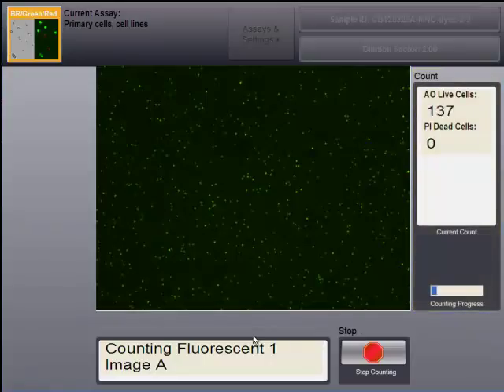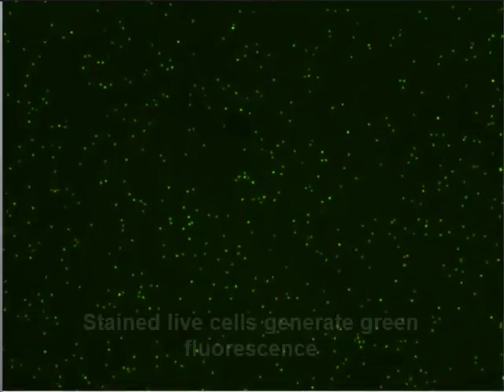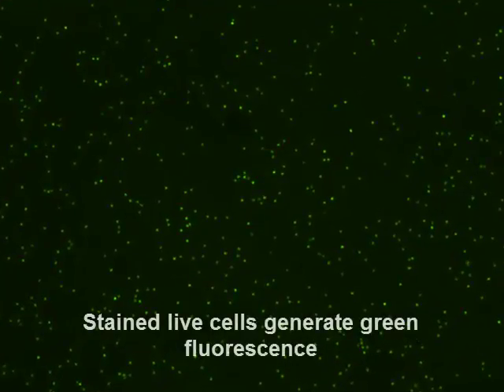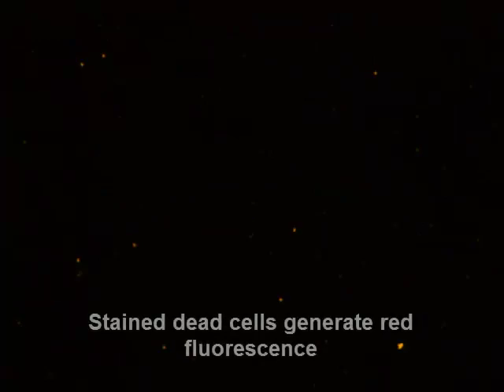Acridine orange is a nuclear staining dye that stains all live nucleated cells, generating green fluorescence that is easily distinguishable from debris and unwanted cell types. Propidium iodide enters dead cells with compromised membranes, generating red fluorescence.